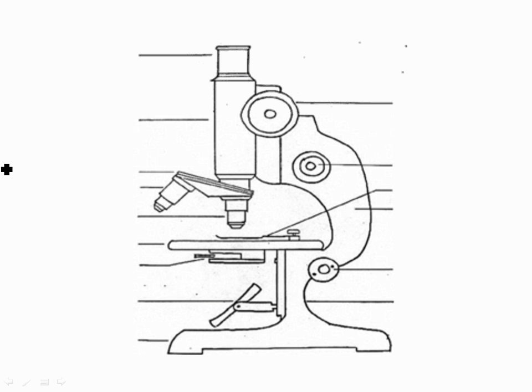Without taking too long, and hopefully I don't mess them up, because I want to eventually get into the lab and we are running out of time, I'm going to attempt to give all the answers here. I'm risking it because I'm recording this, so I could screw this up. This is considered the... did you guys put eyepiece or ocular lens?